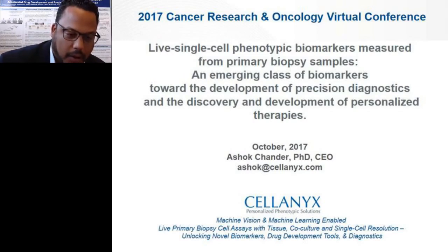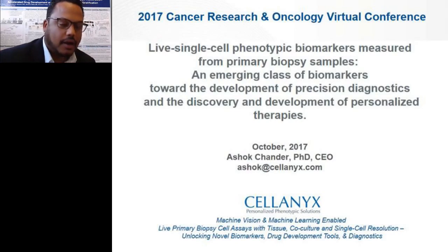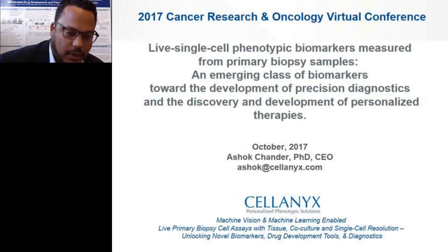Specifically, what I'll go through is why machine vision and machine learning are extremely important for this process towards understanding live cell dynamics as well as tissue, co-culture, and single-cell resolution.